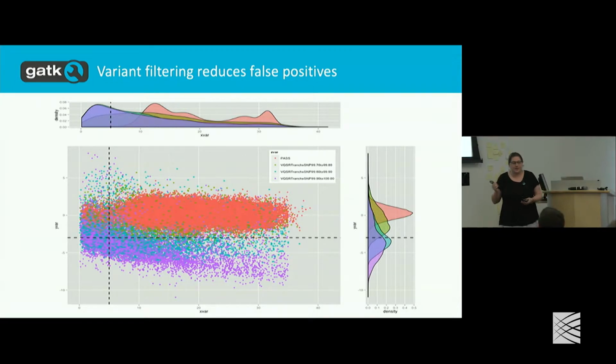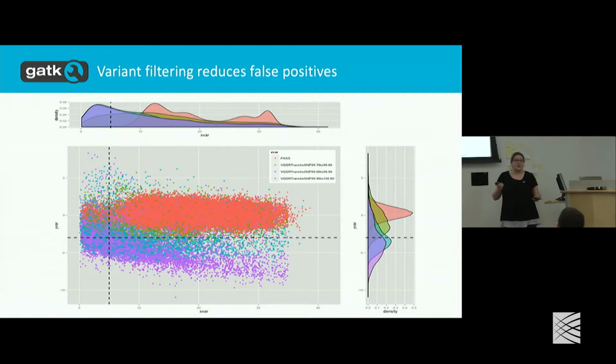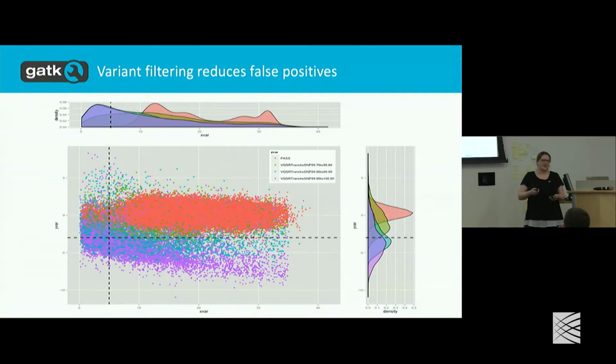I know that our copy number pipelines do output some plots. And then once you have your VCF, you should have the annotations and everything you need in that file format to be able to make your own plots. And I think we'll see that in some of the hands-on tutorials throughout the rest of the talks. And you'll be able to use notebooks in Terra to make these R plots that are really beautiful. And I think we'll see that too.